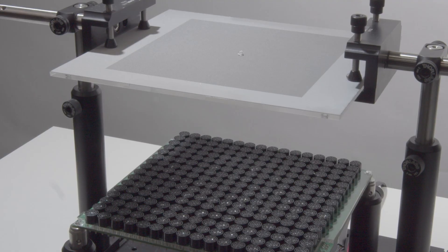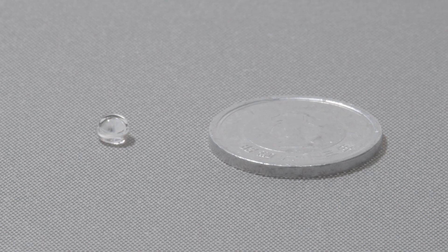In our study, droplet-based microfluidics were achieved by controlling droplets on a hydrophobic mesh by focused ultrasound.